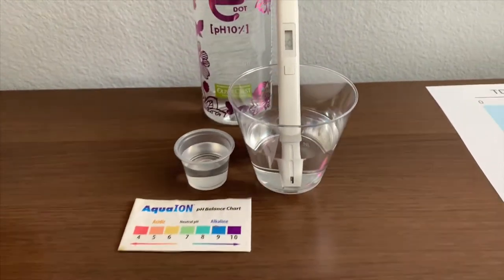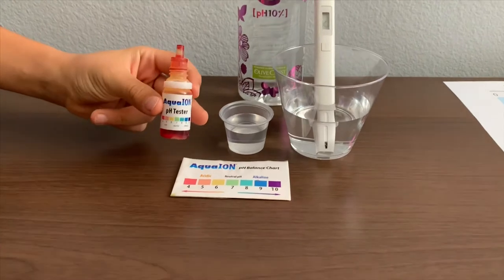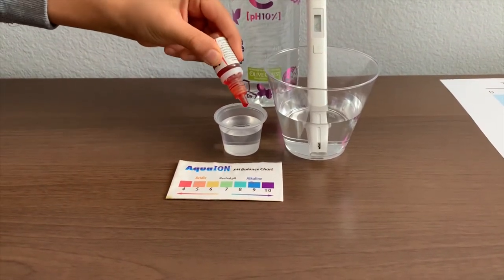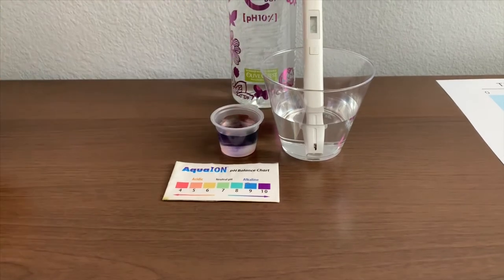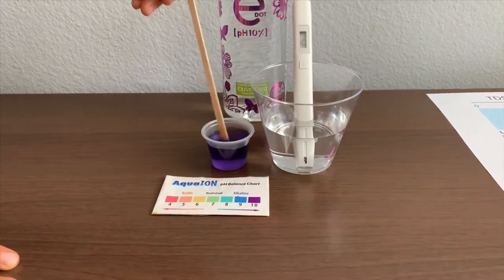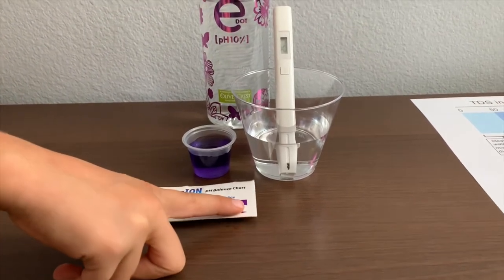Now let's test the pH level. If you want to buy this pH tester, check the link down below. I'm going to do two drops. Let's stir it a little for a better result. I give this a ten. This is alkaline water.